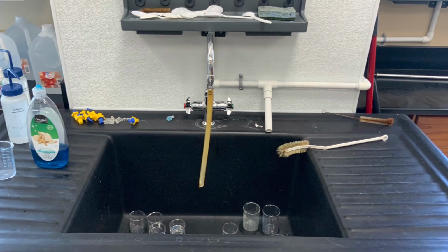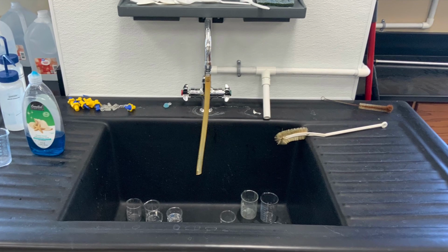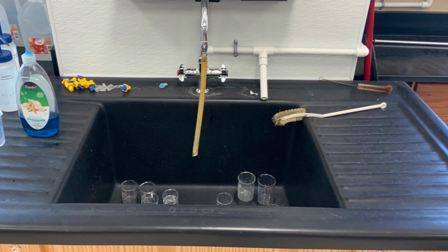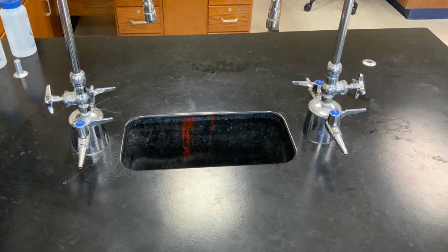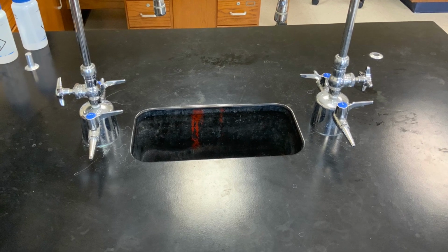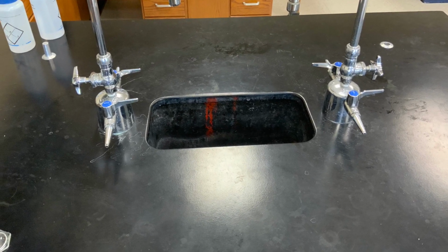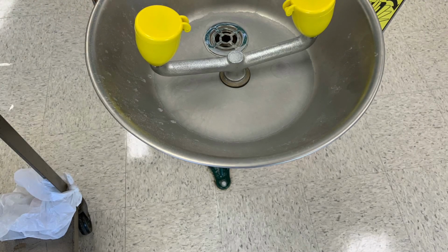Here, photographed, I have two different examples of sinks throughout the lab. Obviously, it's a sink. The main usage of it is to clean out beakers and things of that nature, glassware. But the one particular photograph that I have, of the sinks located at each of the tables, has different access points for Bunsen burners to generate heat for experiments that require any type of heat.